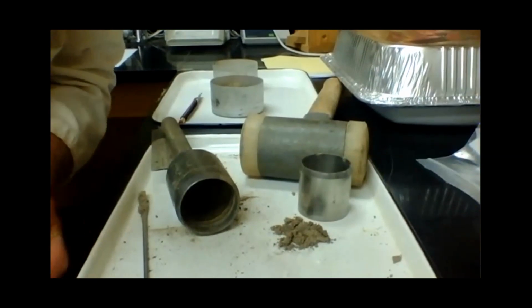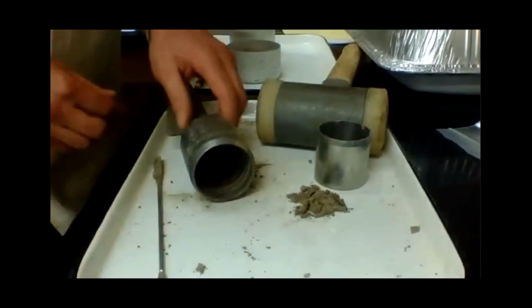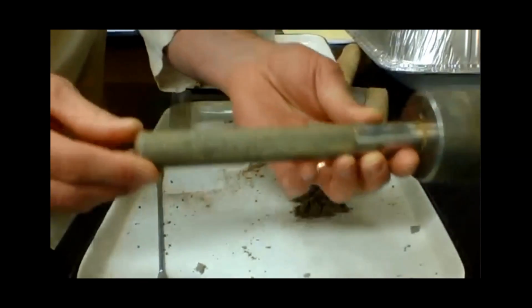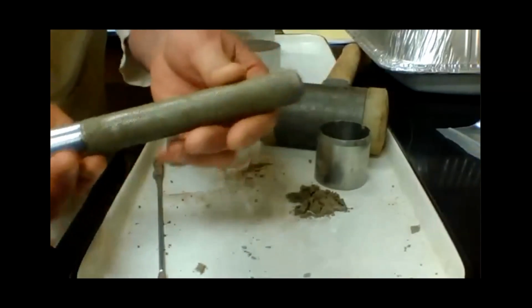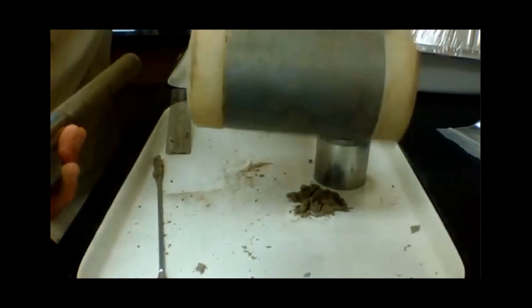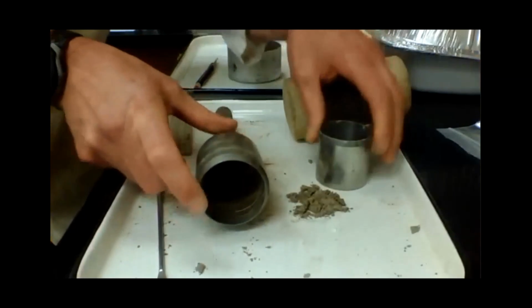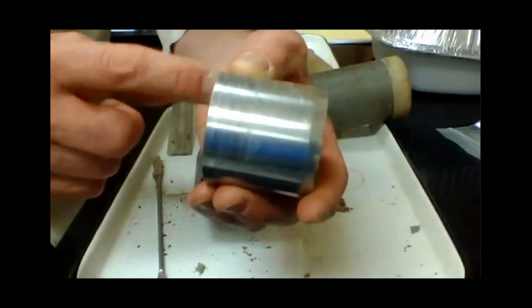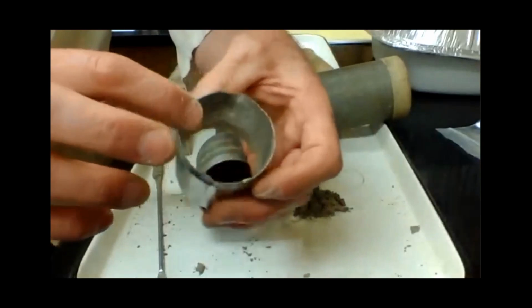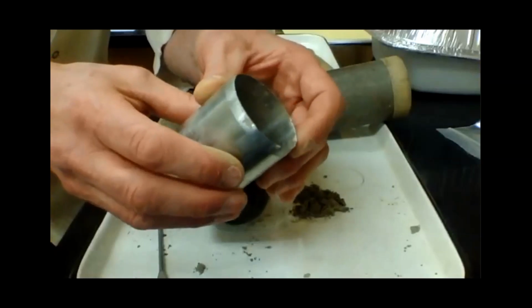So how do we measure bulk density in the field? I've got some of the instruments here that show us how to do that. So this is a bulk density sampler in the field. You can see that it's open-ended here and has a place for us to hammer this into the soil sampling surface. This is the soil bulk density sampling ring. In this case, we know the radius, we know the height of this, and this soil bulk density ring is 100 cubic centimeters in volume.